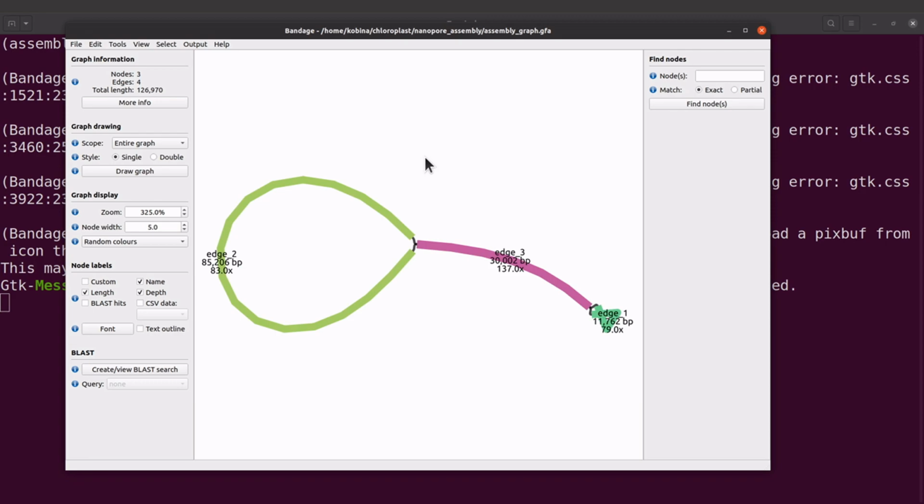All these things can lead to us not having the exact same image, but we will have similar outputs. It's possible that if you do some tweaking, we can get the exact same image, but that's beyond the scope of this tutorial. So let's proceed. The most important thing here is that we're able to reproduce what is there. So there's the image.